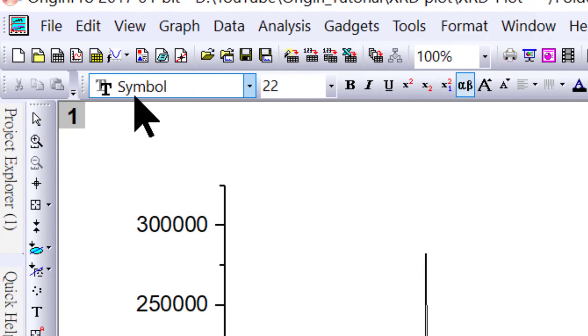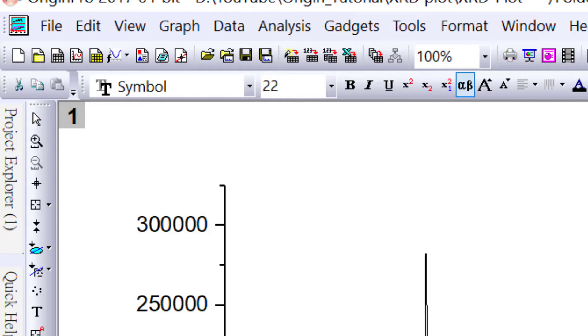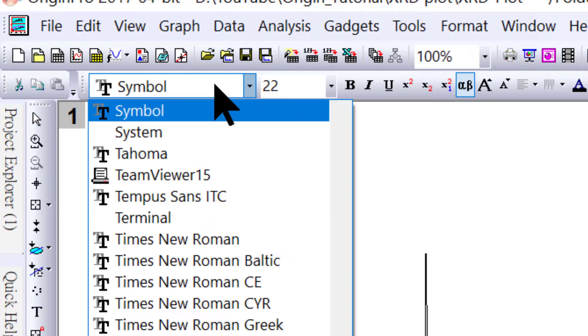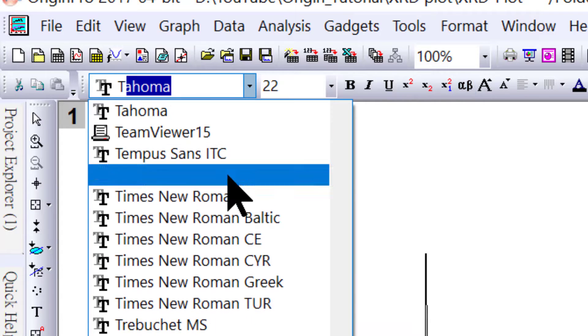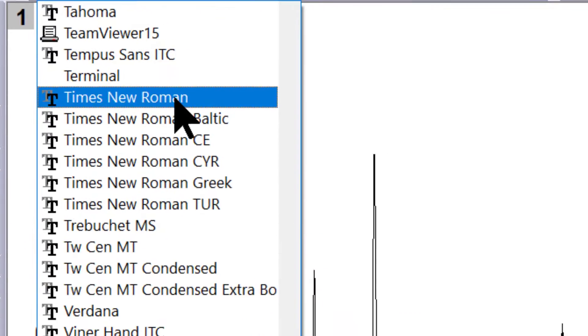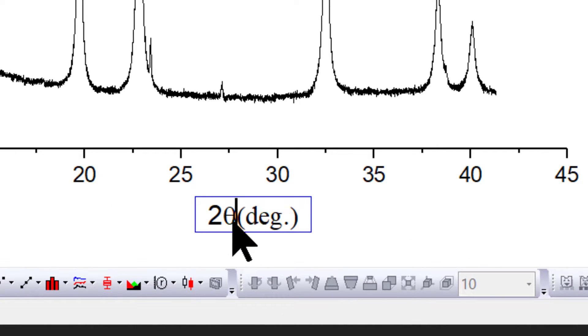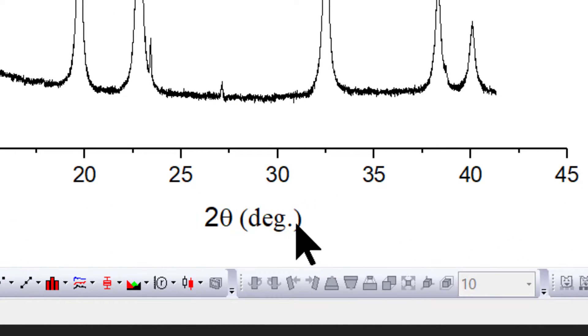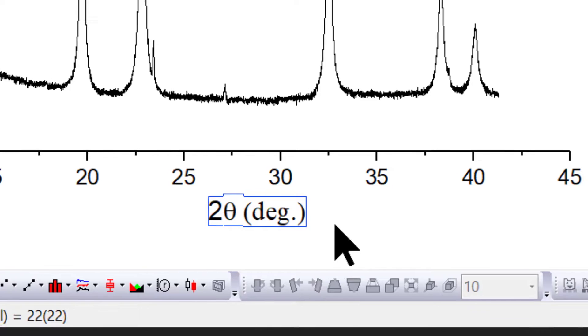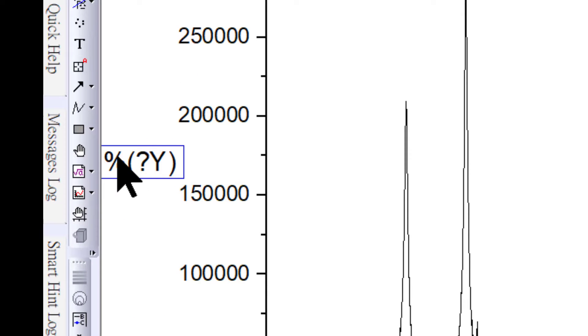Because right now the font is symbol, this needs to be changed. Select the font, maybe Times New Roman or Arial. I'll select Times New Roman. This completes your x-axis.